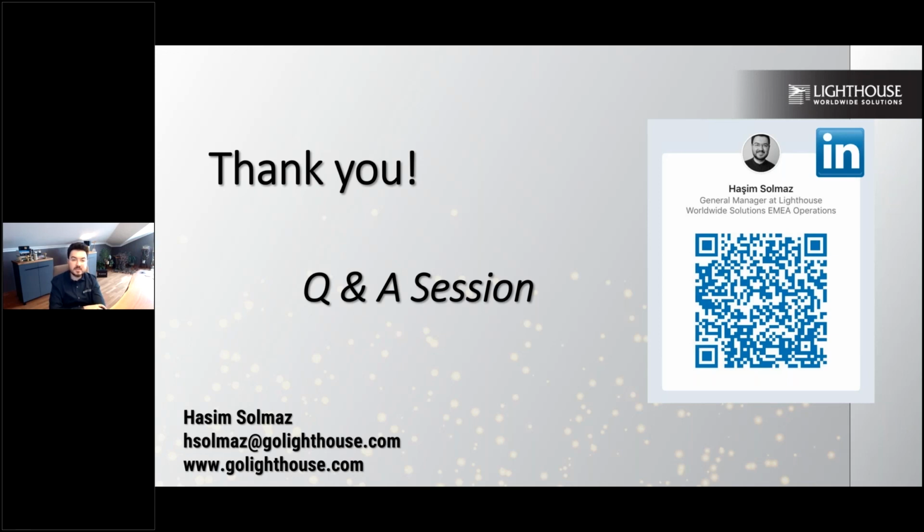So if it requires, let's say, 10 minutes to sample 100 liters, and the pressure changes, then the result will also change in terms of seconds. This can give you 10 minutes, 2 seconds, or 3 seconds. So it can change, but we always make sure that the amount you require to be sampled is the fixed amount.